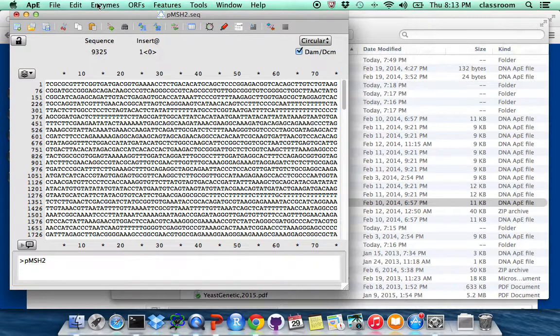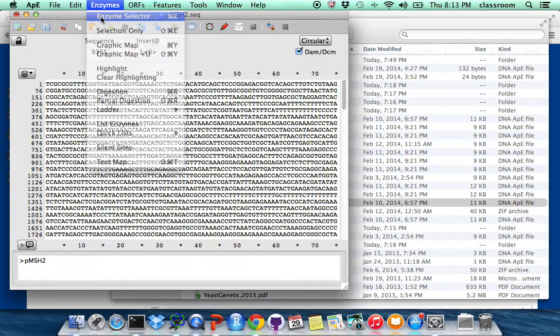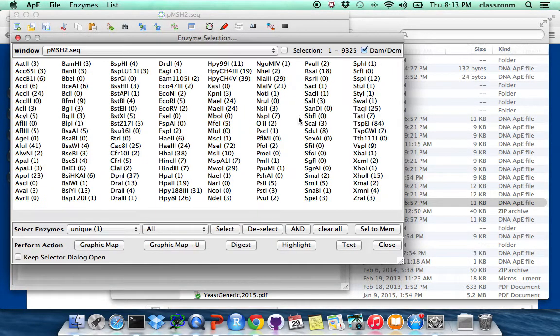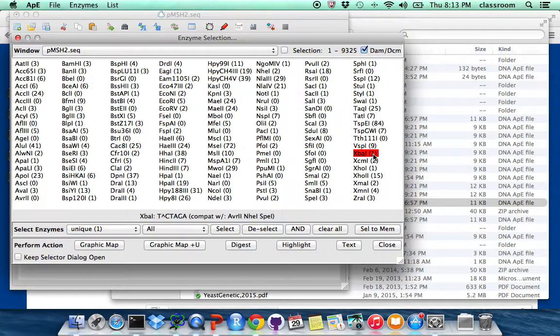And then I go to Enzymes, pick Enzyme Selector, I'm going to pick XBA1. This is a restriction enzyme.